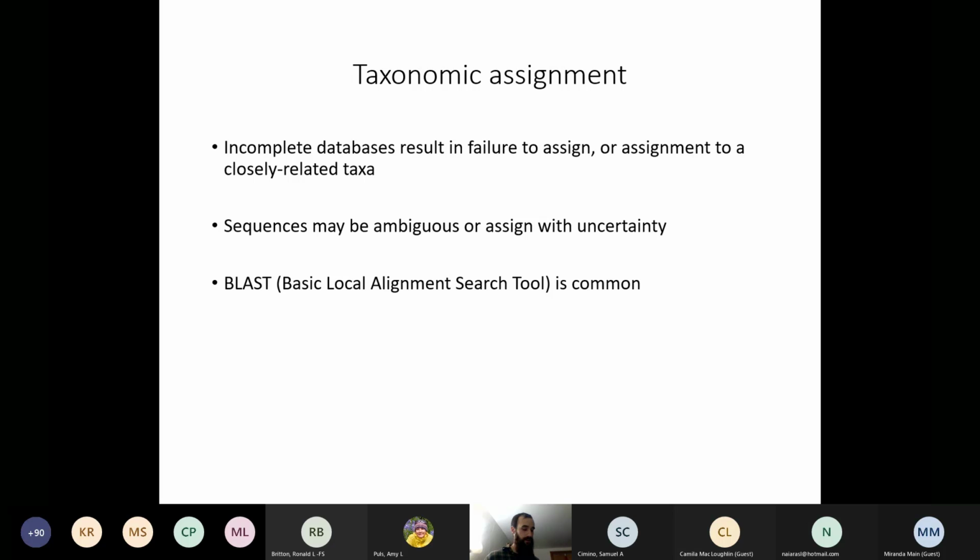And I'm just going to talk about that a little bit at a general level. The idea is pretty simple, where you're going to take the sequences that you have after you've trimmed off your primers and your adapters, you've tried to remove really crappy sequences, you've done some level of data compression, and you've done your clustering using either an ASV or an OTU approach, and you've tried to remove your chimeric sequences. Now you're going to say, well, what is the most similar sequence in my database of sequences associated with species to this sequence? And that must be the species that this sequence came from.